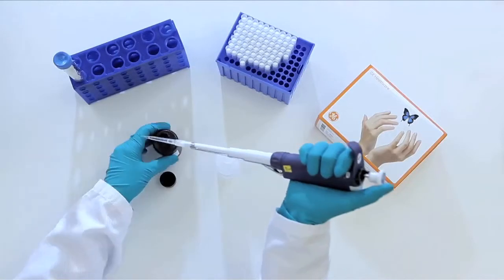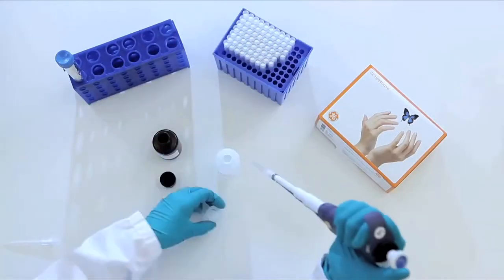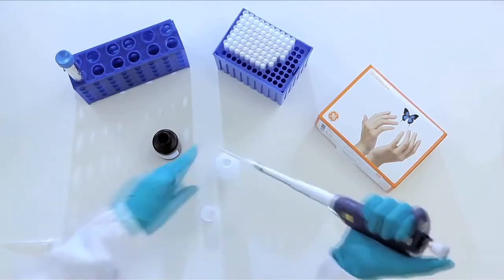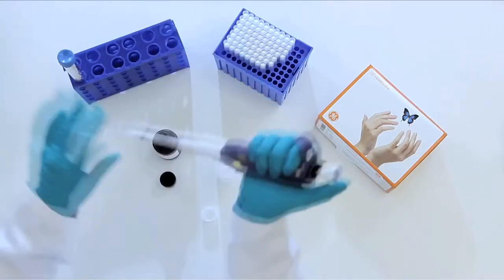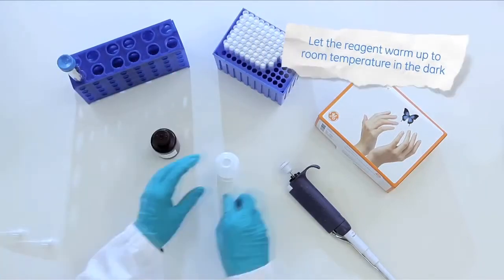ECL Prime Reagent is the ideal choice for detection in western blotting. It works well with all detection methods. Prepare ECL Prime according to the instructions. Allow it to warm up to room temperature in the dark.